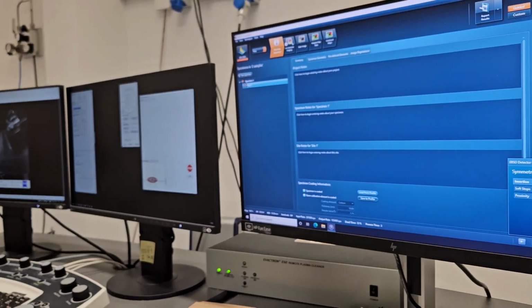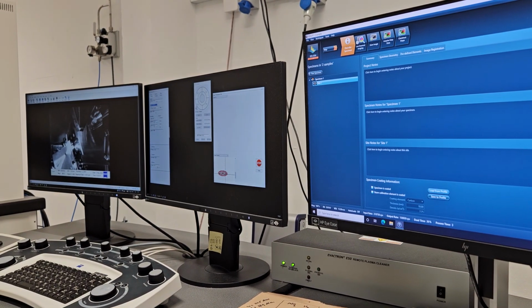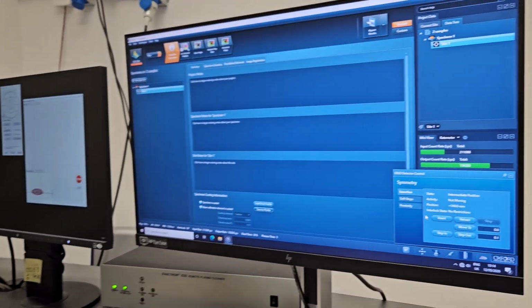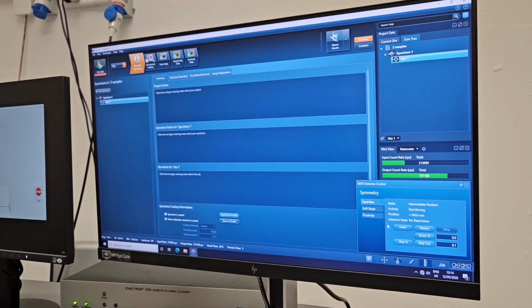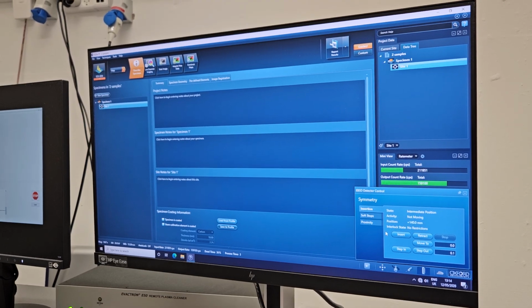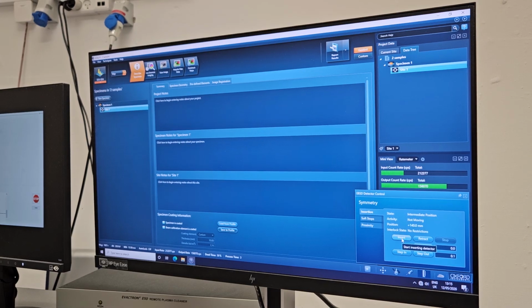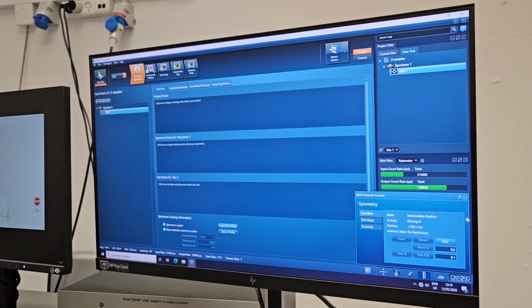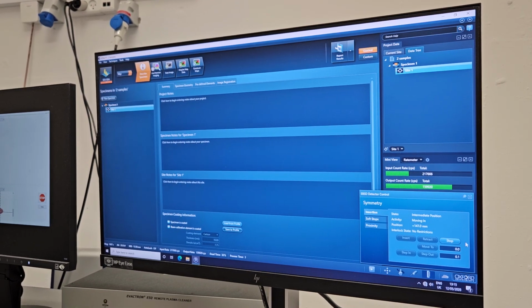One is click, and then it stops here. Stops completely. Yes, that's the first step. It's quick because it's not dangerous. The second step is slow, in order to make sure that you have enough time to stop. So you press insert again, and you will hear that it comes very slowly, and be ready to press stop when you see it's dangerously close.